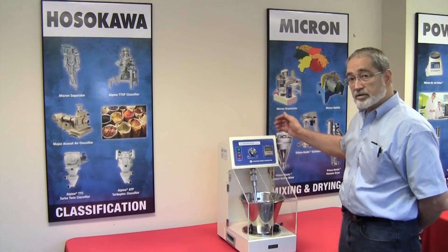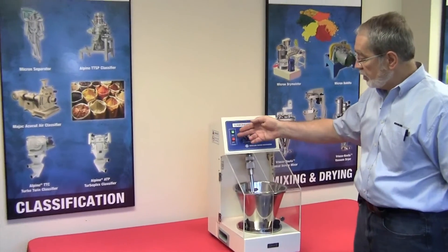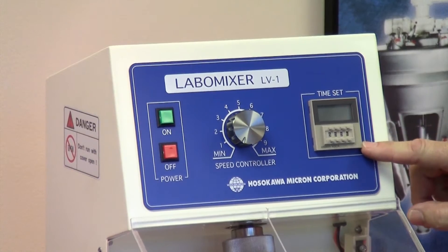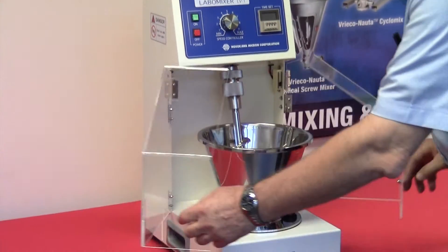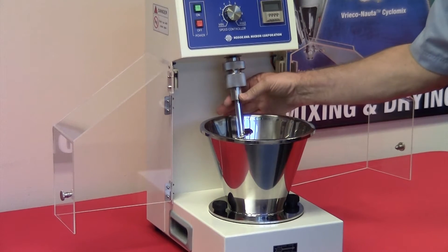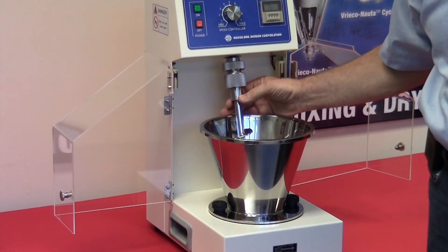The Labomixer is designed simply with an on-off switch, speed control, and timer. The unit has a two and a half liter mixing bowl and a mixing screw, both constructed out of 304 stainless steel.